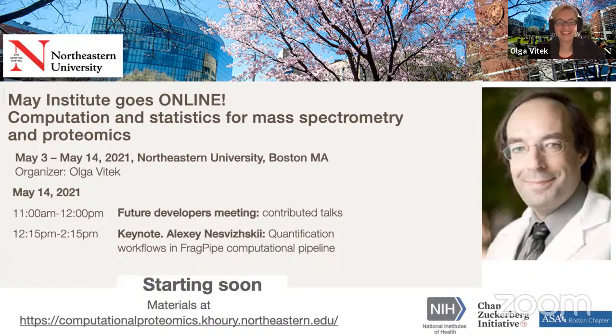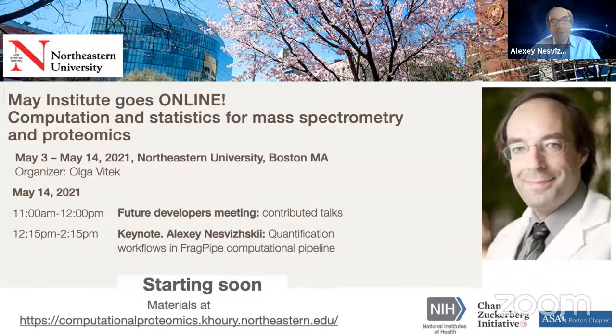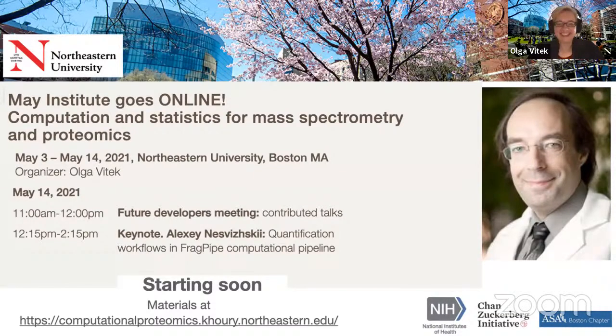As well. So let me end the poll and share the results. So Orbitrap is the winner, but there's also some Bruker and others. It's nice to see that there is a diversity of instruments used. That's right. Okay, so this is all the polls that we have for you. So now, Alexey, it's your turn.